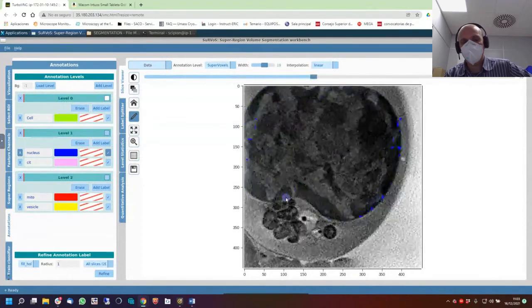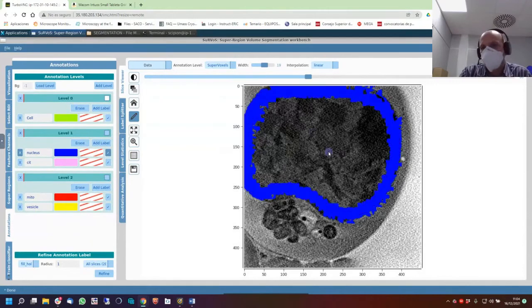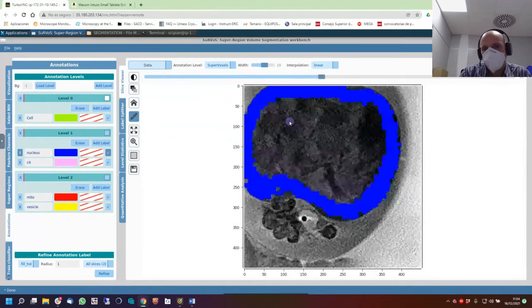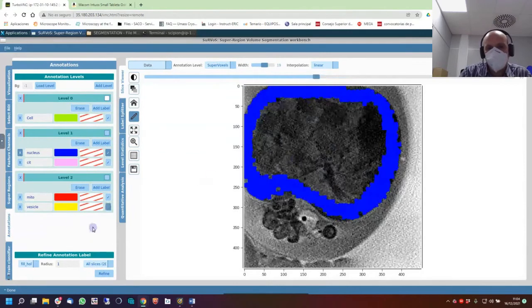Now the other side of the volume. Holes.